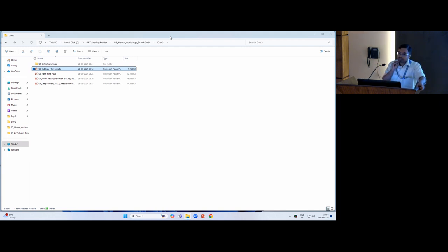So first, you have to look at your own data, how it looks. If you know that the sequencing quality is really good, then really stringent tools like Trimmomatic need not be used. Second is that you can always compare them. There are a lot of papers which only do this. They just compare different tools and tell you what is efficient, what is fast, and what is good for daily use. So that definitely will help you.